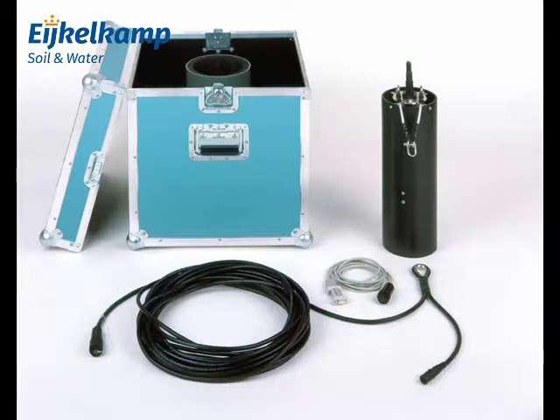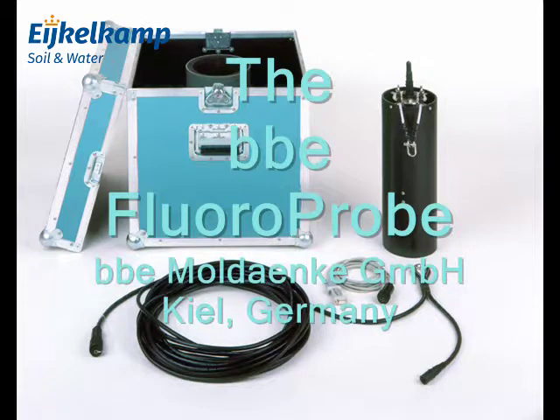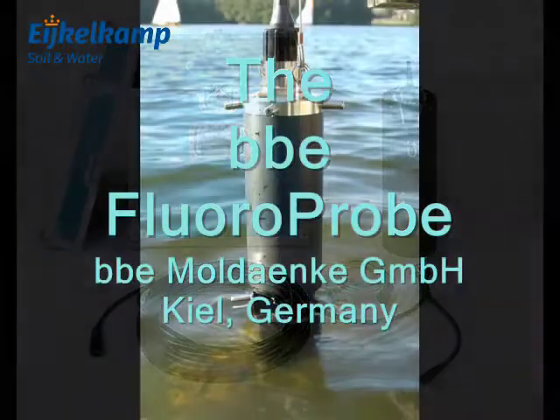The BBE fluoroprobe is a submersible spectrofluorometer with automatic algae class determination and chlorophyll analysis. It determines concentrations of up to five algae classes directly in the water.